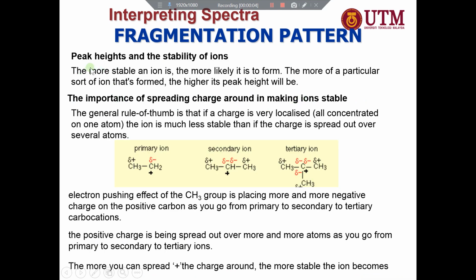Alright. Peak height is the next fragmentation pattern. Peak height reflects the stability of the ion. The more stable an ion is, the more likely it is to form. The more of a particular sort of ion that forms, the higher its peak height will be.